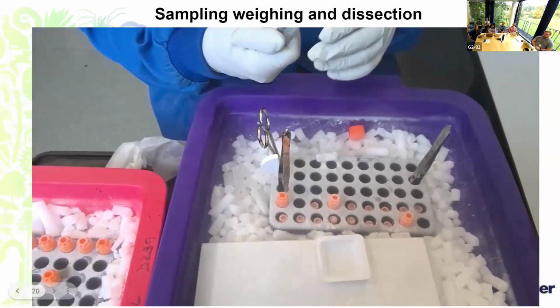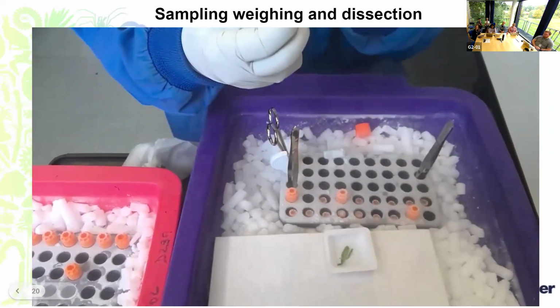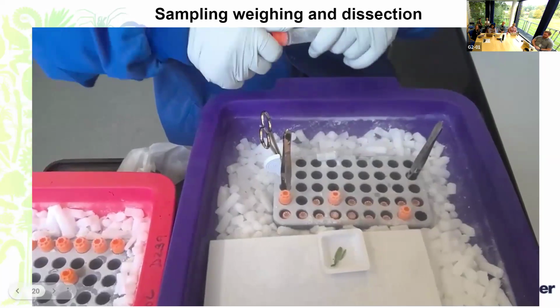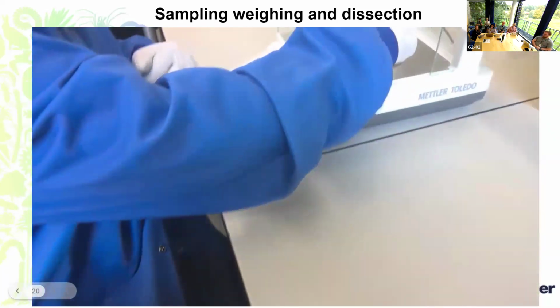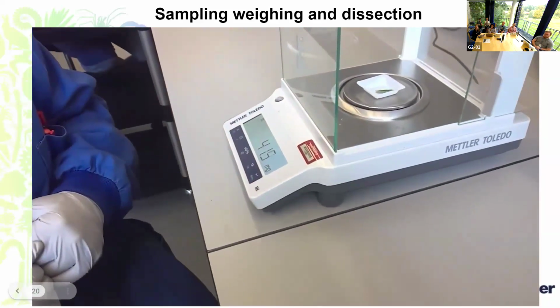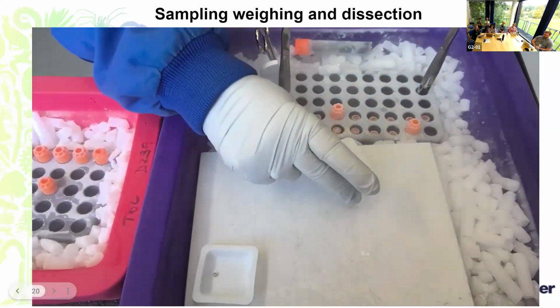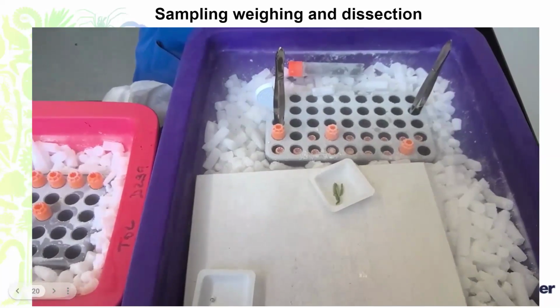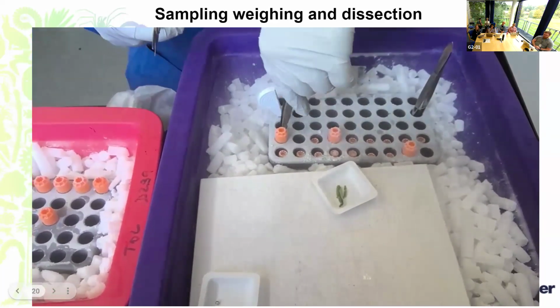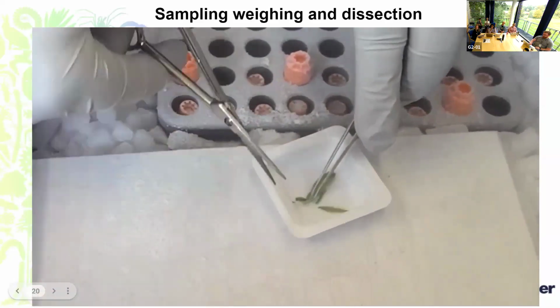So here the samples are being weighed, and we also maintain the beads in cold racks, in order to make sure the entire process is maintained at cold temperature. Now the sample is being weighed. We dissect it into smaller pieces to make sure it gets disrupted properly during the bead beating process.